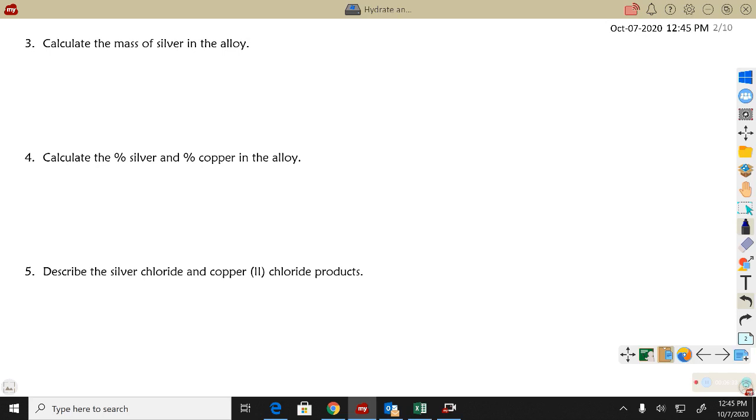So all of the silver from the original alloy should now be in my silver chloride precipitate. We just took the silver, we turned them into ions by reacting them with this nitric acid. Then when I added the chlorine from the sodium chloride, every last silver ion should have then become a silver chloride precipitate. That there should be no silver left behind, no silver in the flask, no silver down the drain. Hopefully it's all in my precipitate.